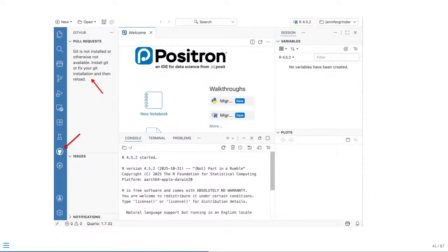If you run into issues at any point during installation of the software, please remember on our GitHub repository, we have the discussions page. Please post your issue there, and I or anybody else who has been encountering a similar issue will be more than glad to help you troubleshoot your installation. We can't do the clicking of the mouse for you, but we can give suggestions as far as what your next troubleshooting steps will be.